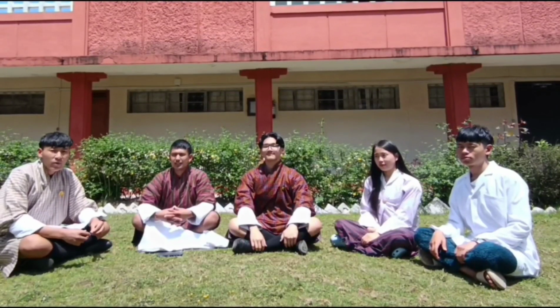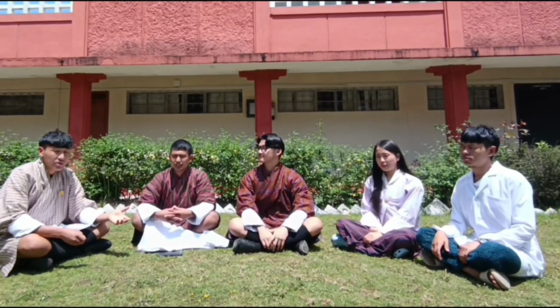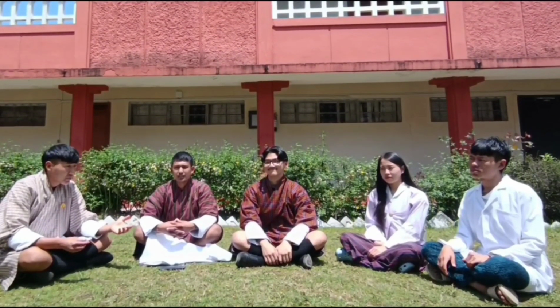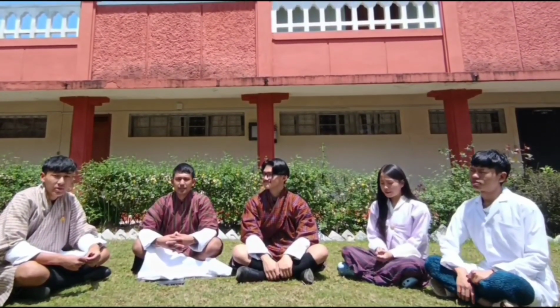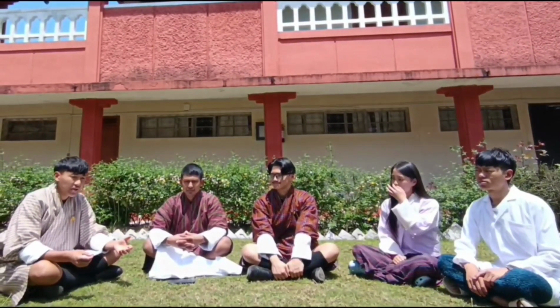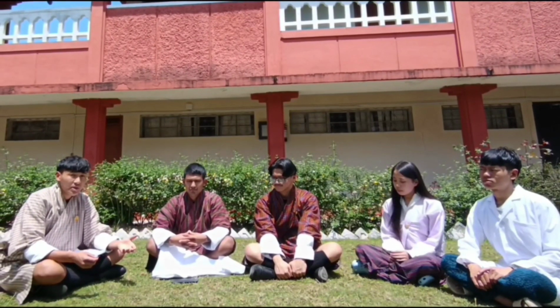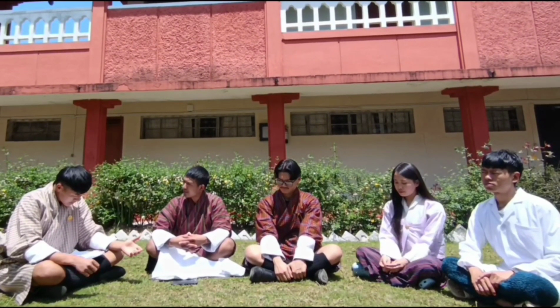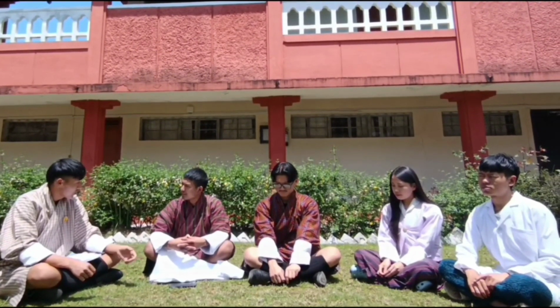Hello everyone. Today we will be doing a panel discussion on the topic centrifugation and cell fractionation. These methods have revolutionized our ability to study the inner workings of cells by enabling the isolation and analysis of individual cellular components. Without further ado, Mr. Som Rigden, can you give a brief introduction and overview on it?